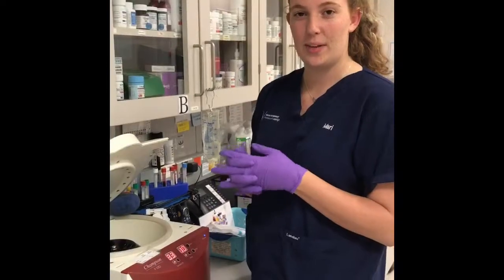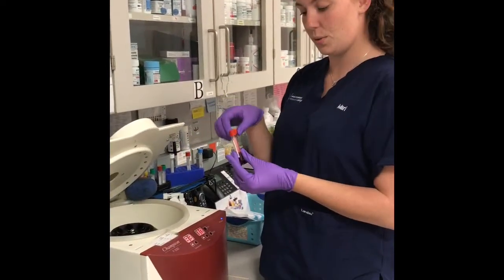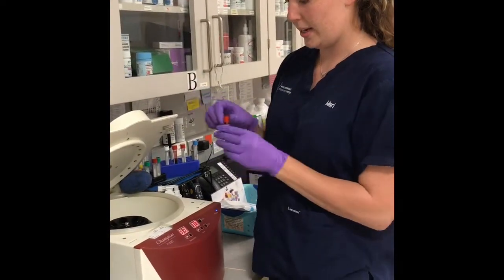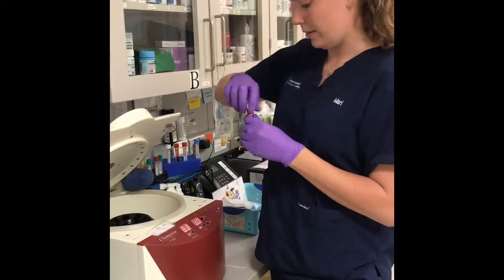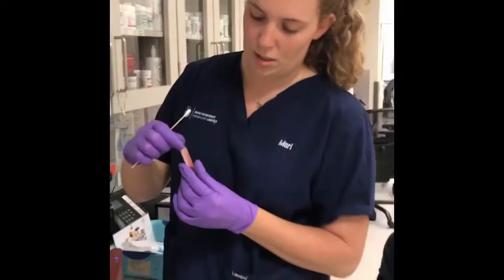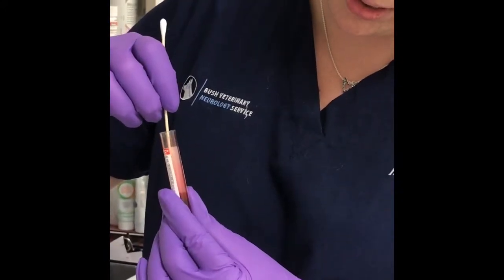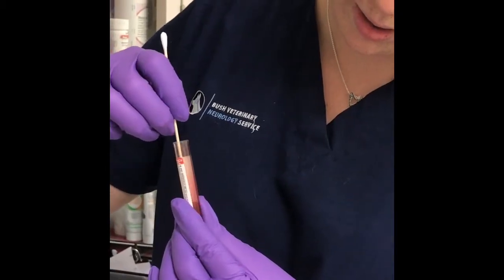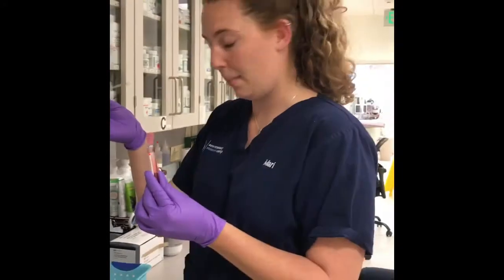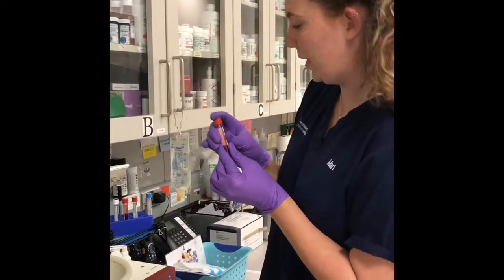All right, so now that we've allowed Cece's serum separator tubes about 30 minutes to clot, we're going to go ahead and spin them down to harvest our serum. So I'm going to take our red top, and first I'm going to make sure to rim the tube. This is just going to break the clot loose from the edges of the tube. Just stick it in and spin it around. I'm going to use the end of a cotton tip applicator to do so. Go ahead and put the cap back on that.